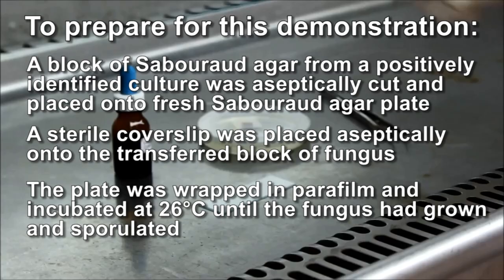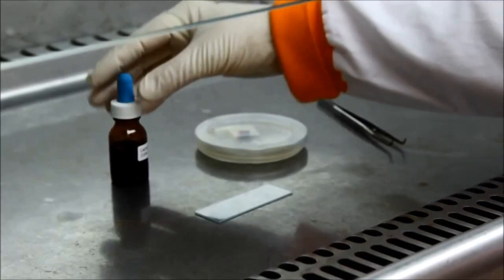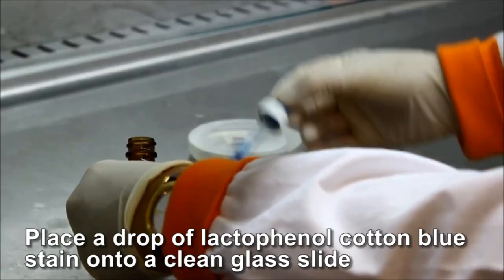Staining the coverslip with lactophenol cotton blue. Working inside a biological safety cabinet, place a drop of lactophenol cotton blue stain onto a clean glass slide.